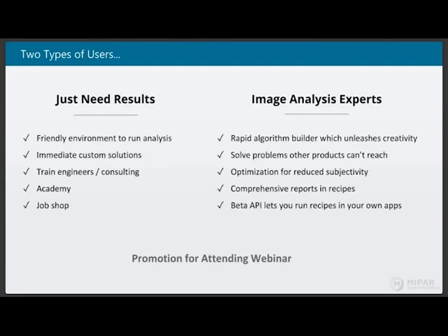A couple of notes about it. Once you start working with images that are 200 megabytes to a gigabyte in size, MIPAR will open and run its algorithms on an image of any size, but your workstation hardware just has to match that. So if you're working with large images, we do recommend that you have a workstation with hardware specifications that match that workload.